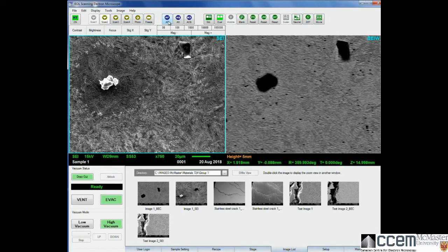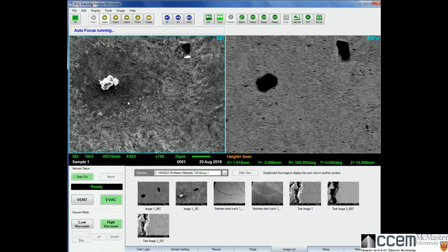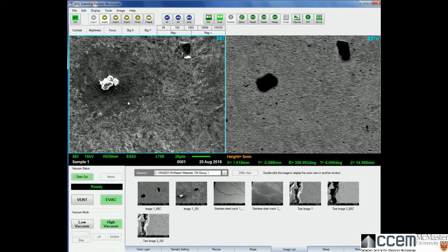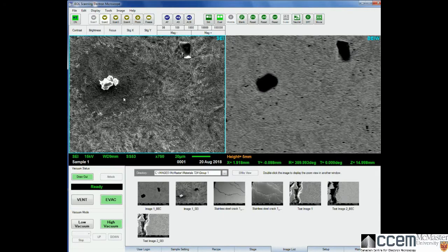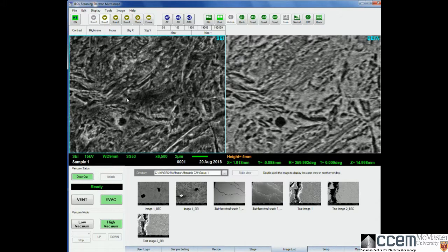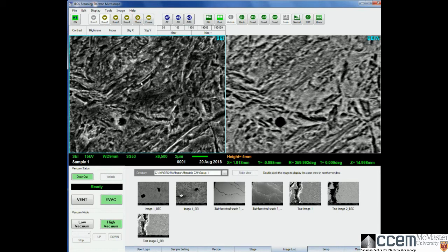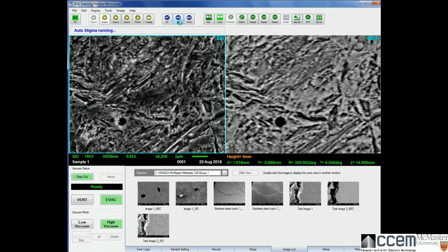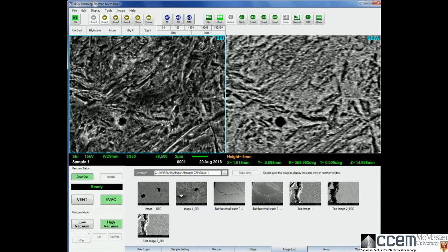We do have autofocus. The problem with autofocus is it doesn't always work — you may find that it actually goes all blurry. We are sometimes successful and it does work, which is good. But it is available there to do adjustment. There's also auto-stigmation, which is sometimes useful so you don't have to play around with stigmation as much. It seems to have more success being adjusted than autofocus.